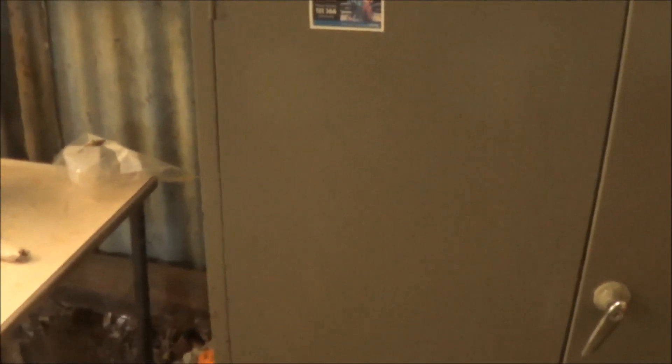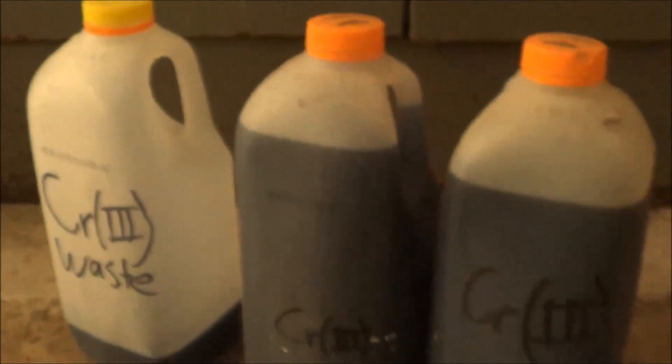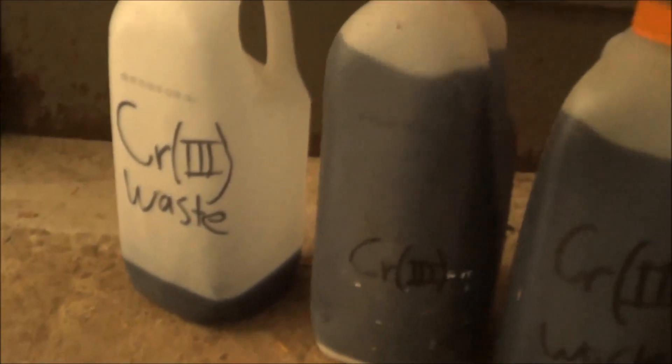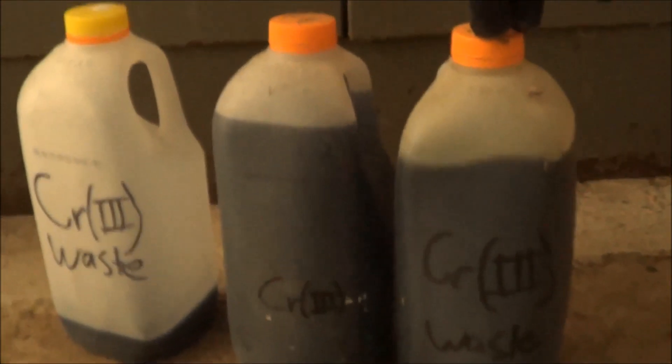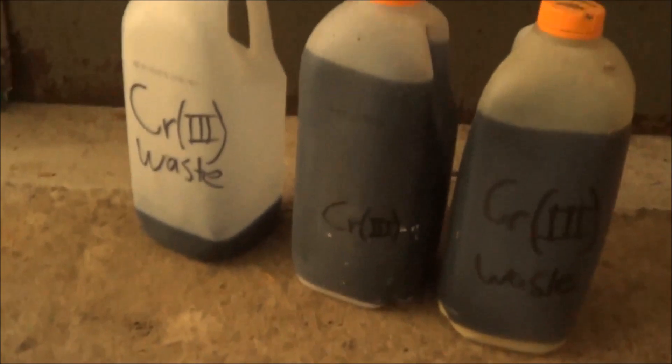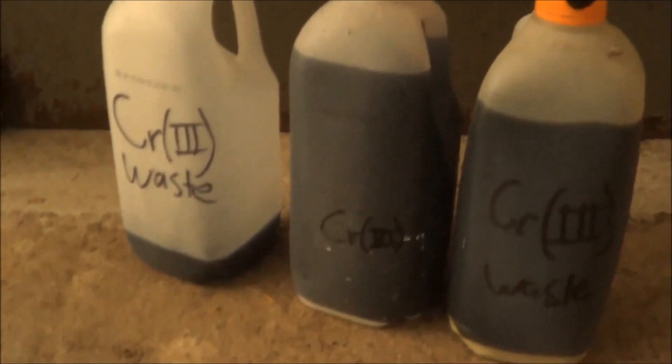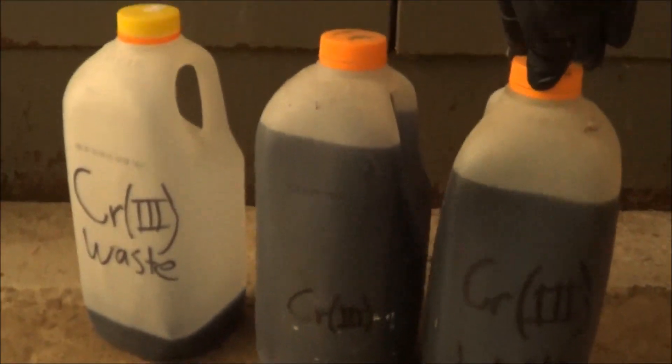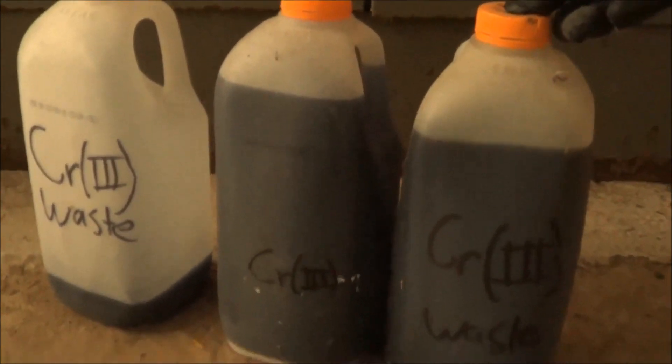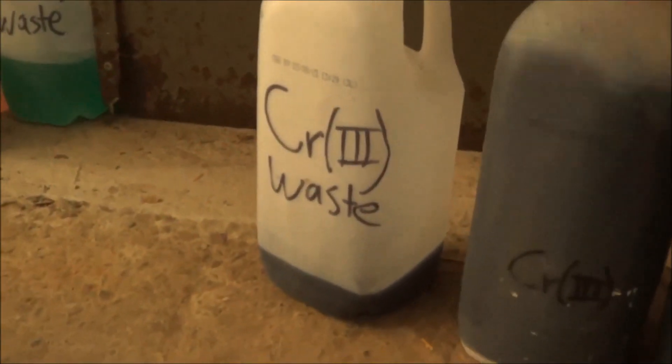Now, given that we're a year on, a good question to ask is, what happened to all the waste products from all the chromium chemistry I've done over the year? Well, it's still in temporary storage. I guess it's sort of permanent storage in a way, because at some point I'll have so much of this chromium-3 solution that it'll be viable to turn it back into dichromates. Or maybe one day I'll take these to a disposal facility, because it's not very good for the environment at all to put it into septic or into the garden or anything like that. So it's good to just reduce it back to chromium-3 and then store them in these bottles.